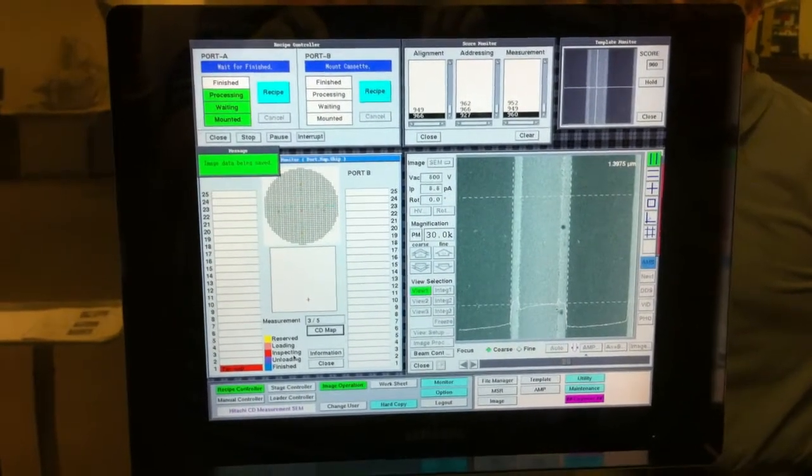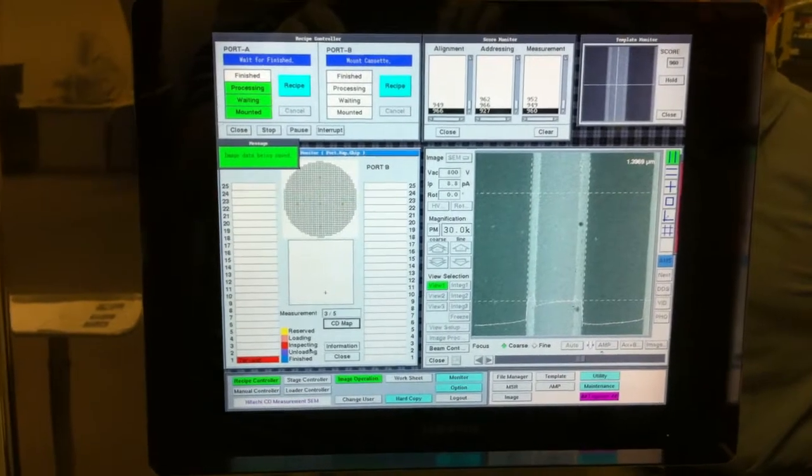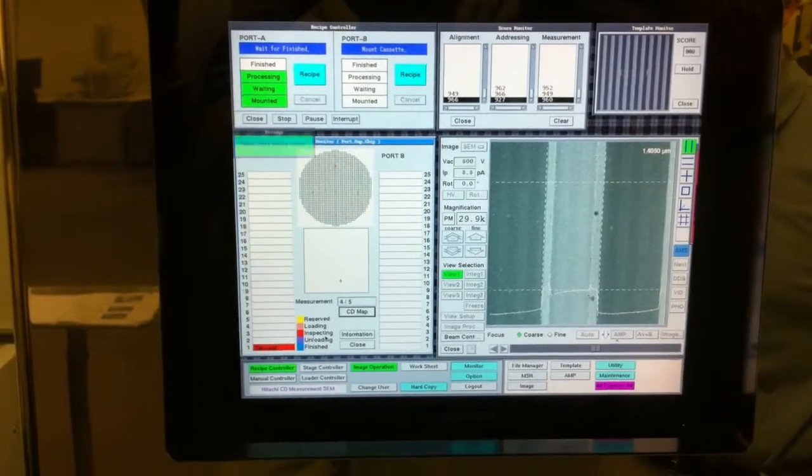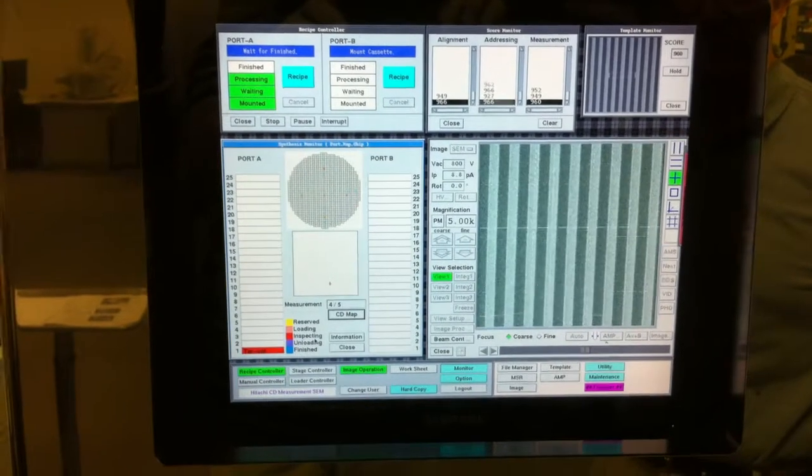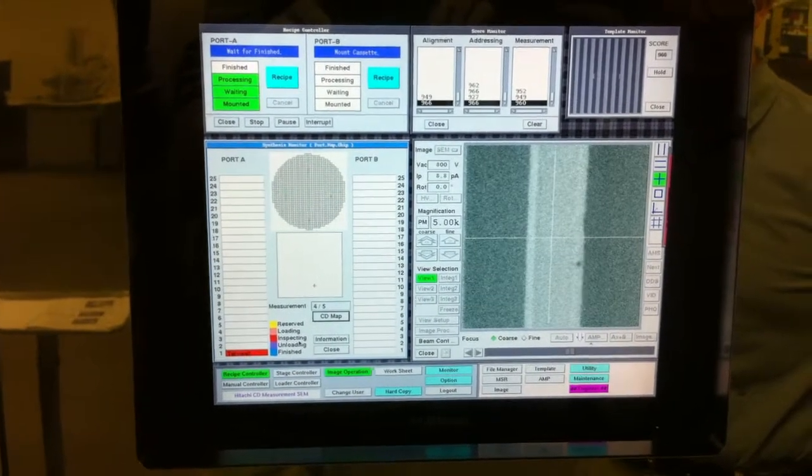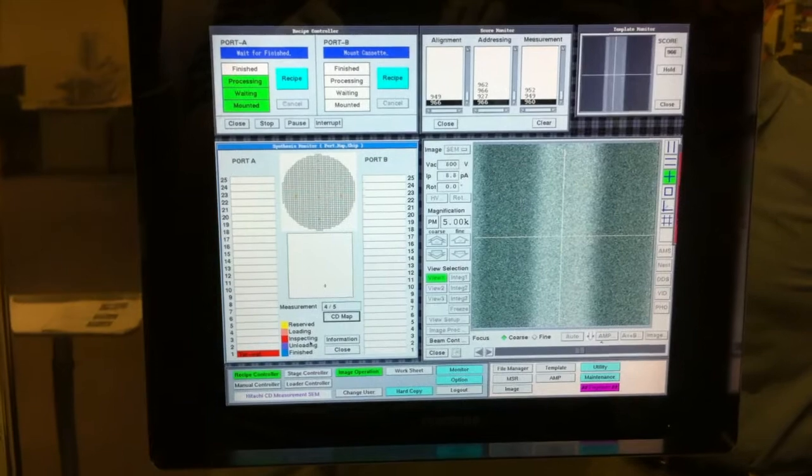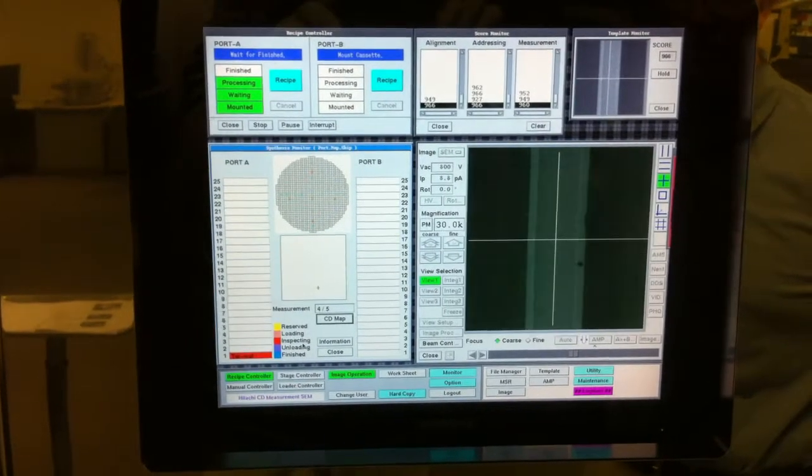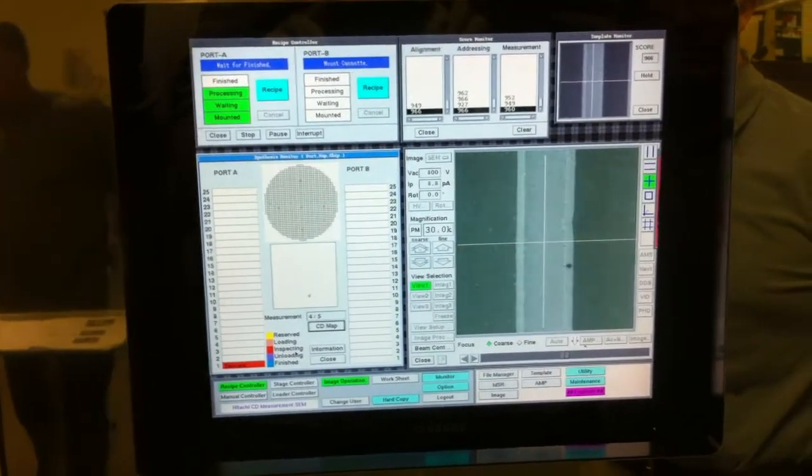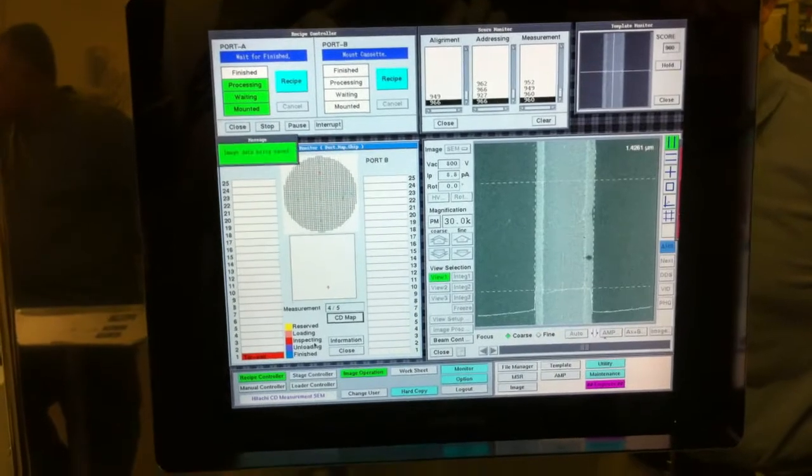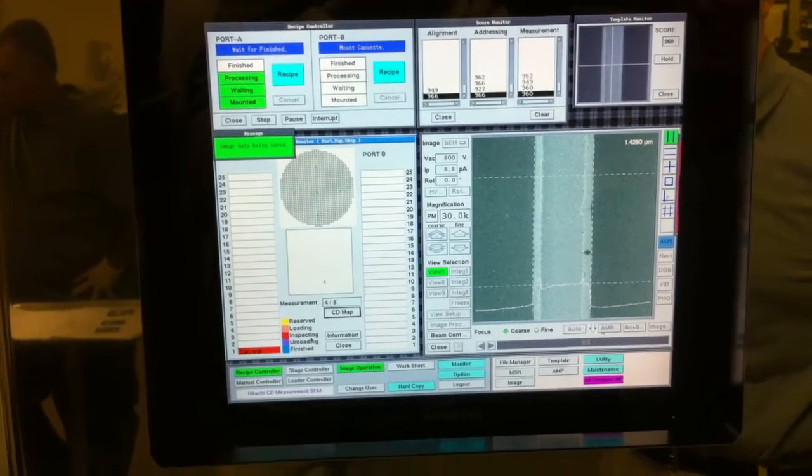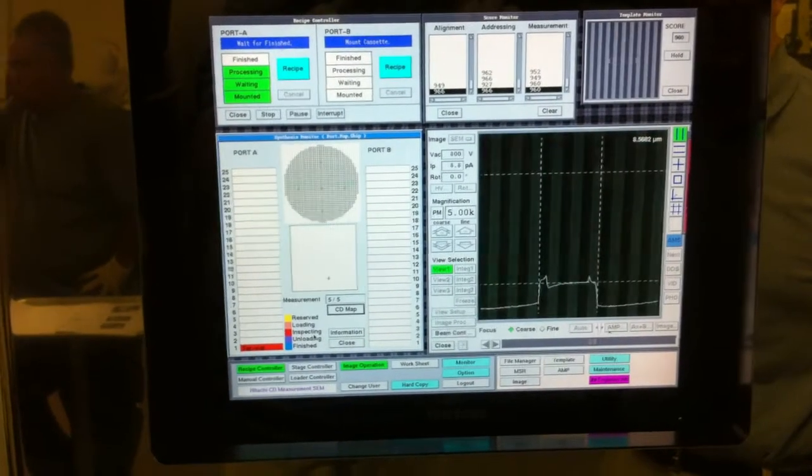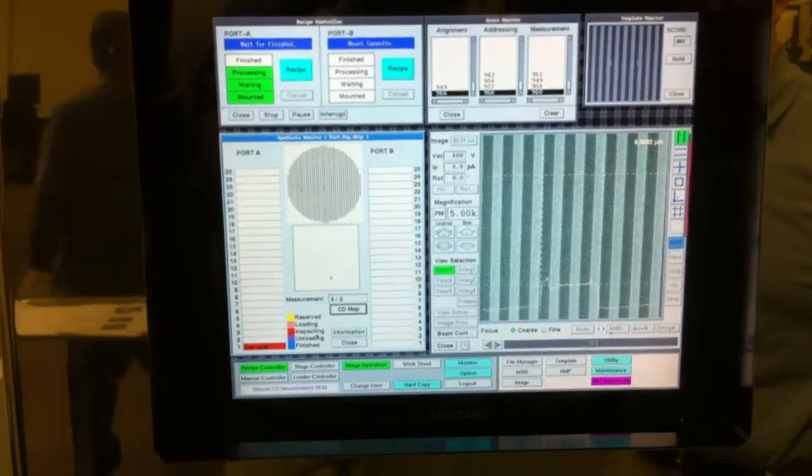During our testing, we do save the images on each site to review. We're using the Pierce algorithm for the feature because it's the best one for that. And coming up to the last measurement site.